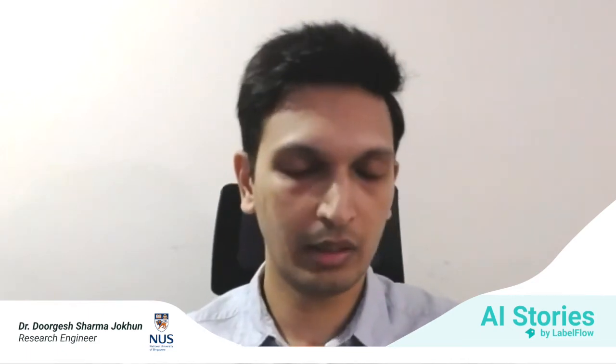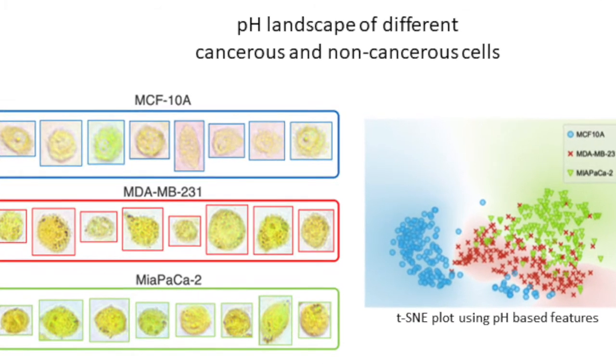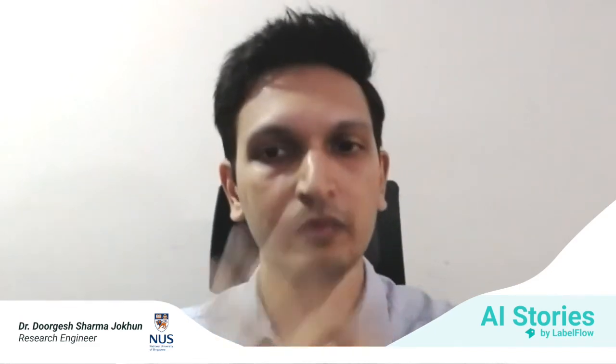So what we've known, again, for a long time now, is that within a cell, the pH is not uniform. Different organelles, different regions of the cells will have different pH depending on their functions. And in cancers or in other diseases as well, the maintenance of this pH is disturbed. So what we are trying to do now is, if we can get an image, a map of this pH distribution, can we use that to know whether this map corresponds to a normal pH distribution or a disease pH distribution? So we extract all the features, and then comes the machine learning part, where we train the model: okay, these patterns are associated with healthy cells, these patterns are associated with cancer cells. So that's the general pipeline right now.